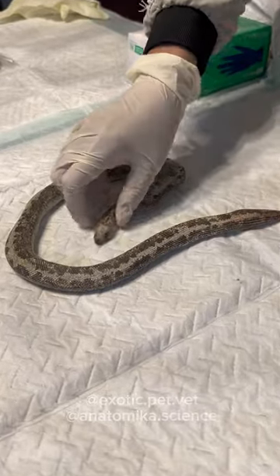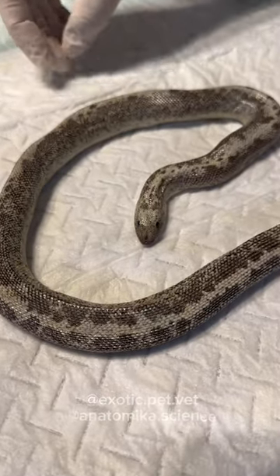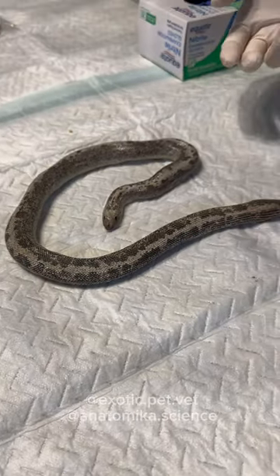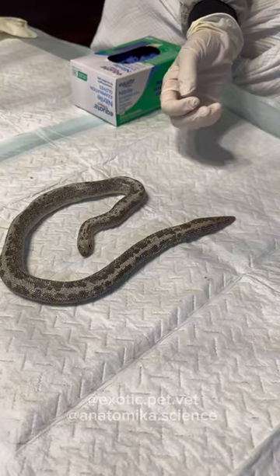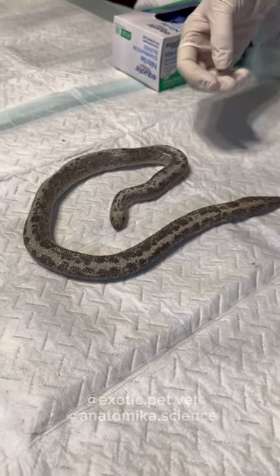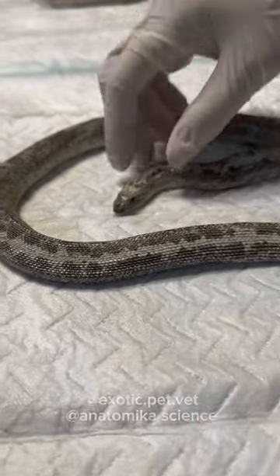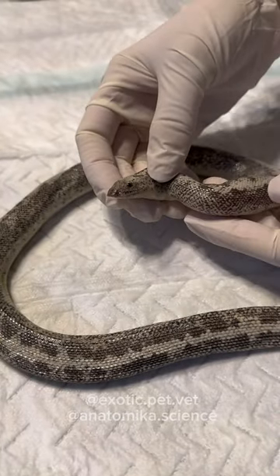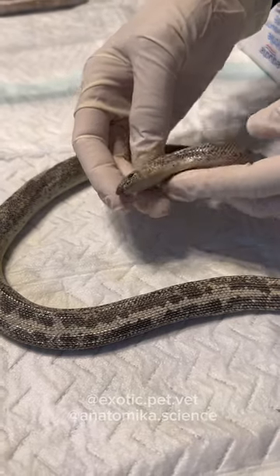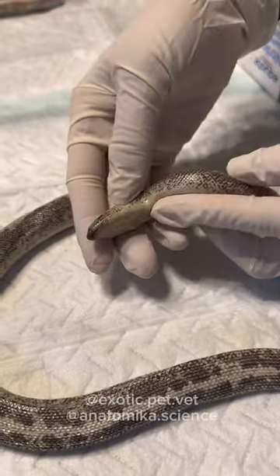So this looks like a Kenyan Sand Boa, and I know a lot of reptile owners like to do their own necropsies or take a look at animals when they die. This is something I always encourage, because even if you can't get a professional necropsy from a veterinarian, I always encourage people to open up their animals after they die, just to get a look at what happened to them and get some familiarity with the health condition. You can never have too much information about the health of your animals.